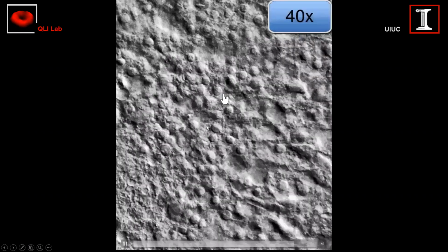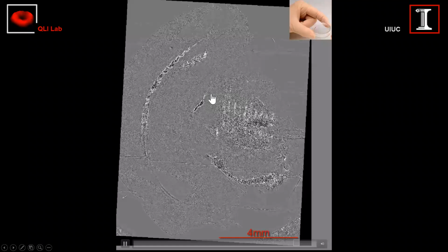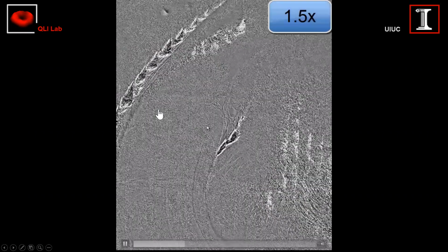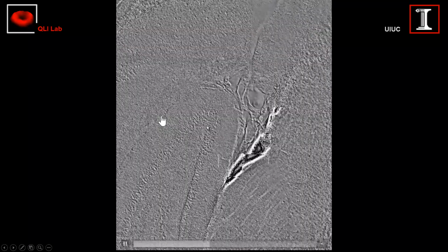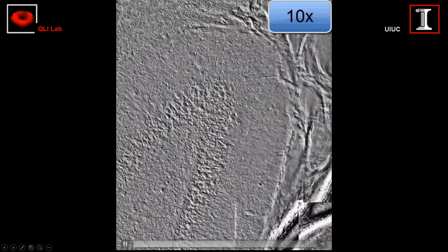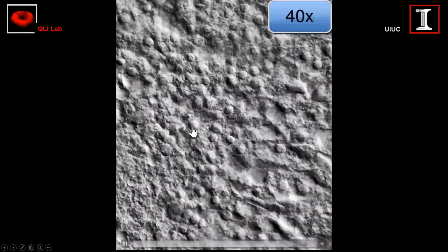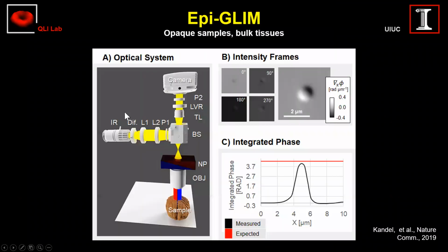All very interesting and completely new. Nobody's looked with quantifying cell growth, cell mass in basically a live kind of brain slice, or at least close to its natural state, at least for a couple of hours. So this is ongoing.